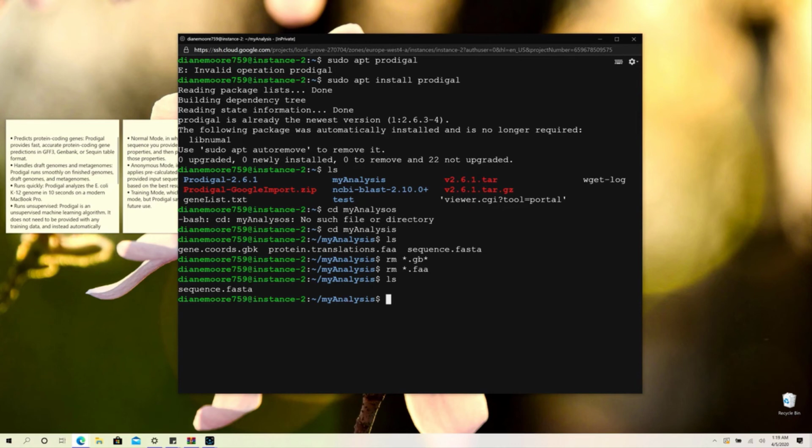You can do that as well, but in most cases when you are doing gene prediction, you don't really download a genome from a dataset. You have your own genome because you have just sequenced it. In some cases you can download it, but this is basically how you do gene prediction for a genome. I'm going to utilize this particular genome.